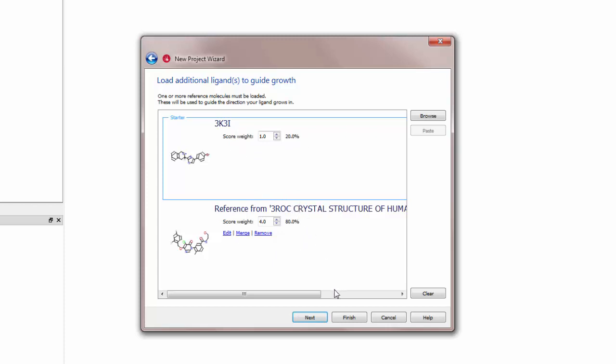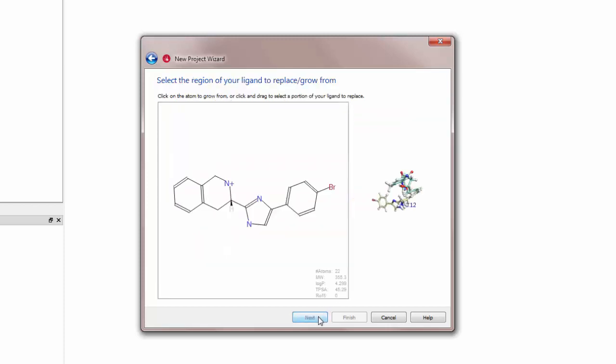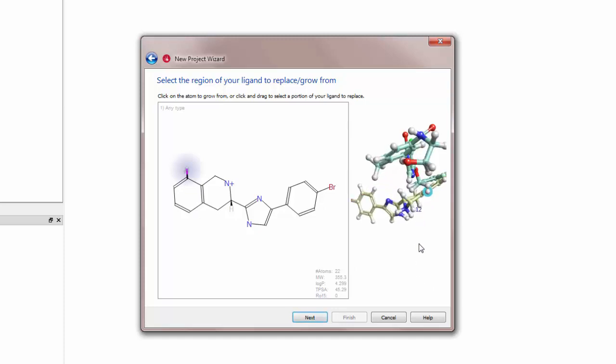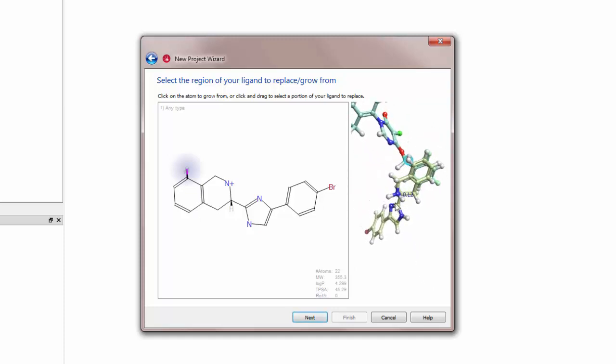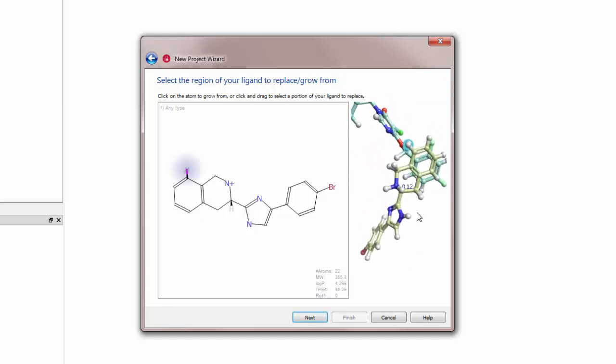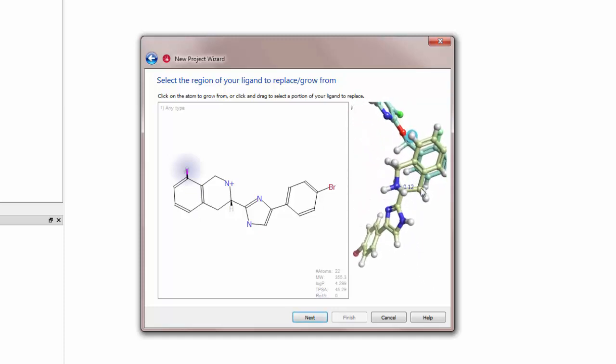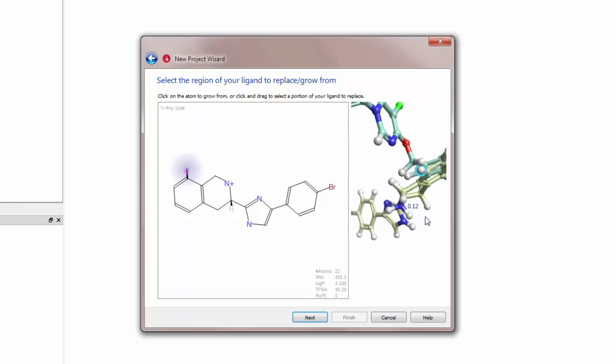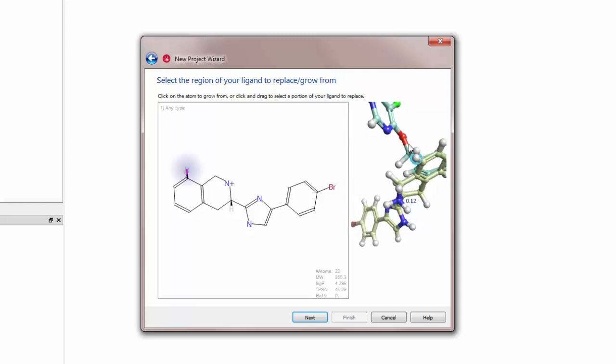After clicking Next I will decide where I want to grow my ligand from. Looking at the 3D view on the right hand side of the wizard panel I can identify a position on the fused ring of the 3K3I ligand. I will click on the appropriate atom in the 2D structure.